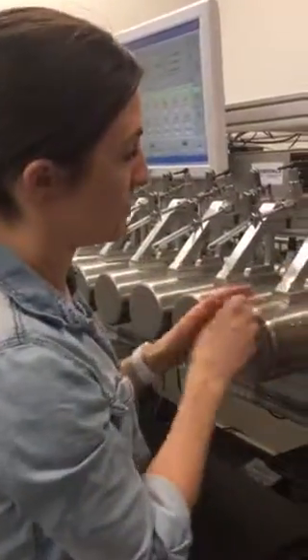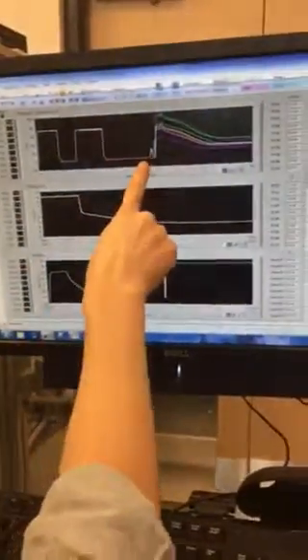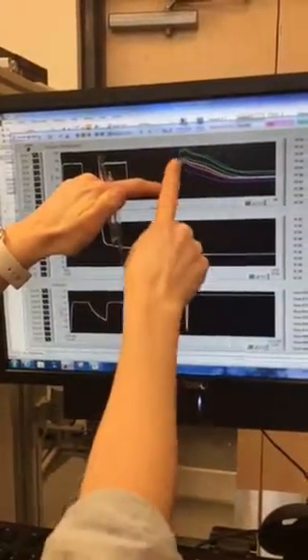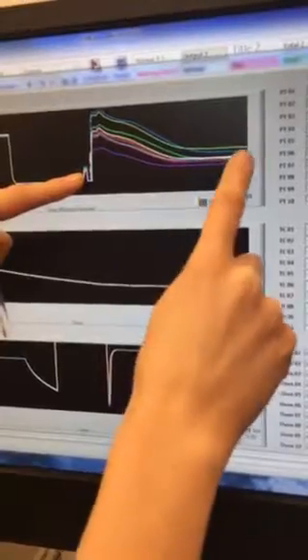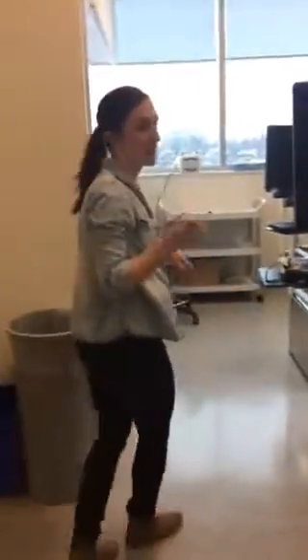And as you turn gases into solids, the pressure in the reaction cell goes down. So each one of these reaction cells has a pressure transducer. And if you look over on the screen, this is the pressure of CO2 plus hydrogen. That's the pressure of CO2. This is the pressure of CO2 plus hydrogen. And during the reaction, the pressure comes down. And these samples are actually almost done. I'm pretty much ready to take them off because now the change in pressure is stable. So at this stage, what we have is elemental carbon adhered to iron powder.